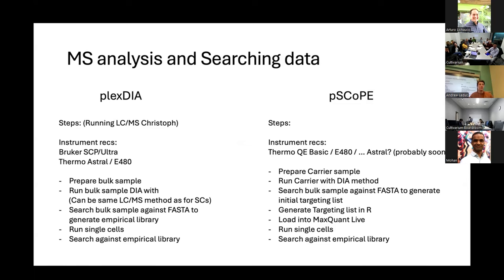And so the mass tags now, more simply, and we recycled a really old product that had been used a long time ago, have different masses. So you can actually see them both at the precursor level and at the fragment level. You can just tell these things apart. Their mass is shifted in both the fragments and the original ion by 0, 4, and 8. So these are the two workflows that we're using in the lab.